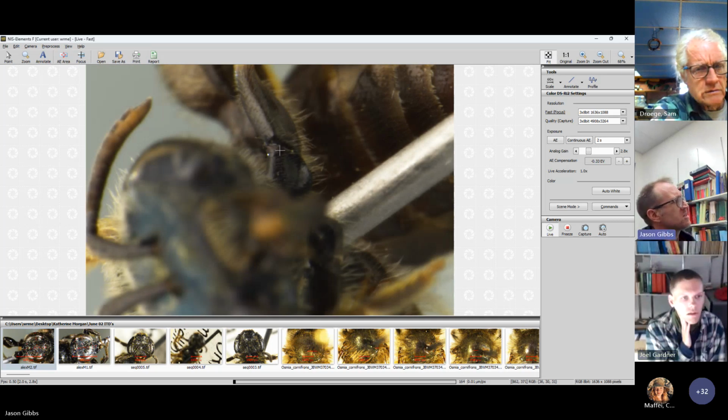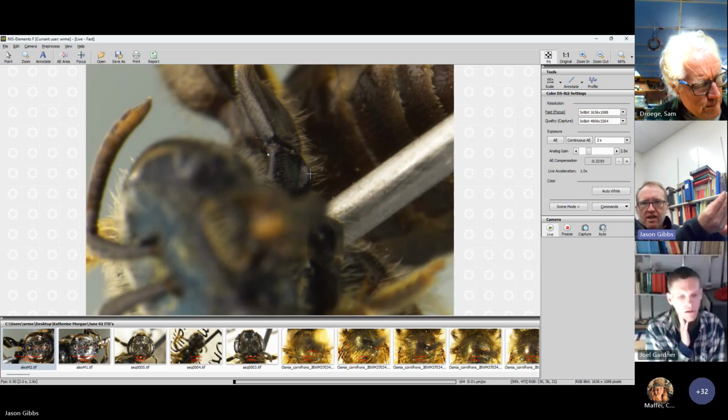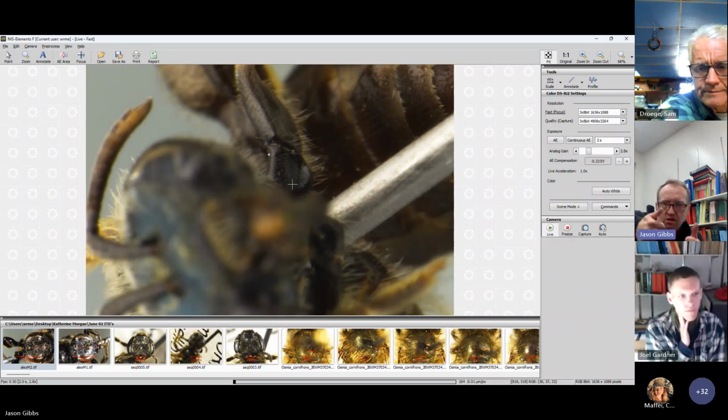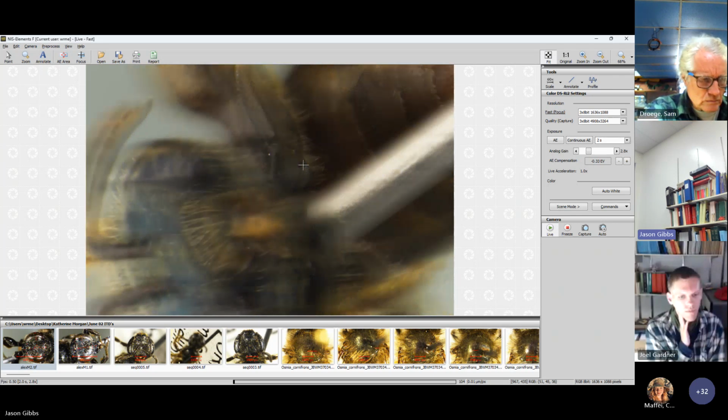So you can see this is the front trochanter here, and it's really wide. It's almost like if it was clay, like someone has pulled the bottom, kind of stretched the bottom out, and you can kind of feel that concavity that Joel was talking about is even more obvious in connexum. It's kind of like a little thumbprint, and then someone tugged it out. So that's pretty typical.